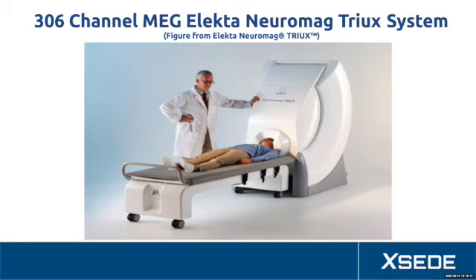And part of the challenge is not only is it expensive to buy, but then you have to build a special room for it so the external fields from the planet don't interfere. And this makes it a challenge, and then you have to have helium to run it. So unless you have helium close by, you're not going to be able to run an instrument like this. So they're very rare instruments. Next slide, please.